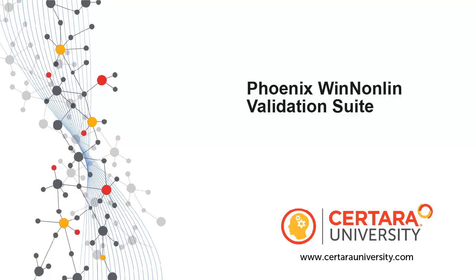In this video, we will demonstrate how to perform validation of Phoenix WinNonlin using the Validation Suite.